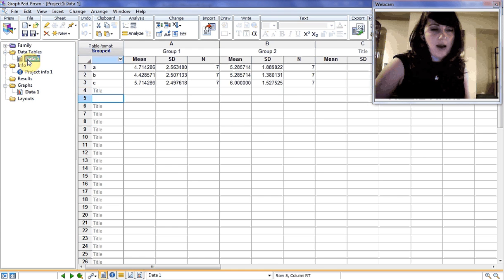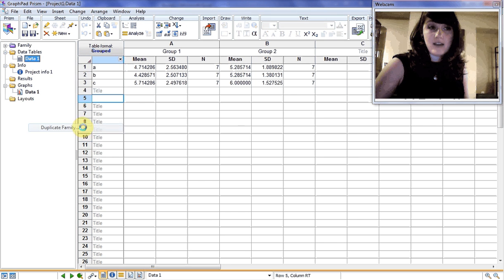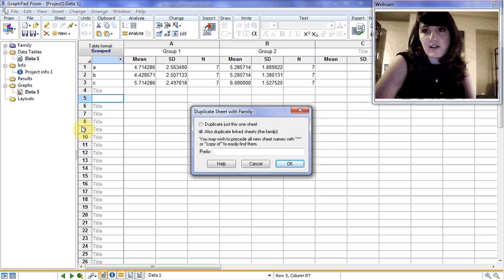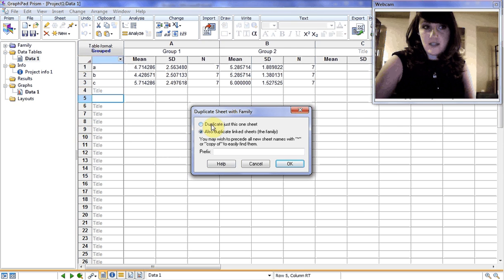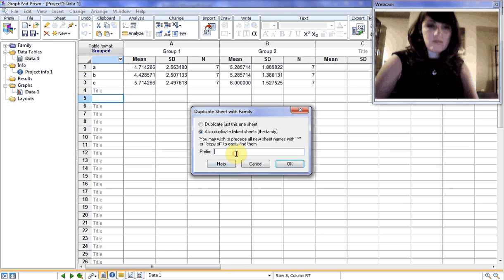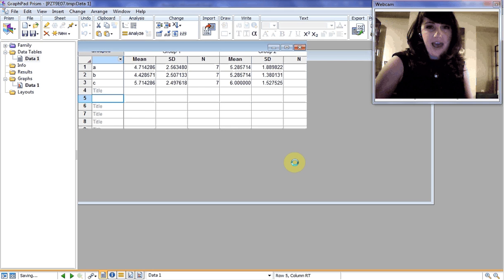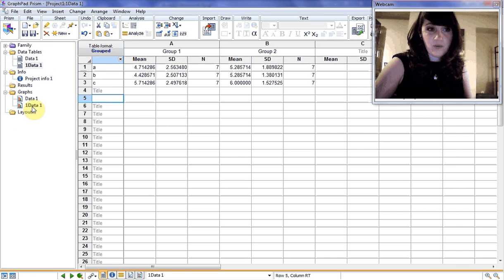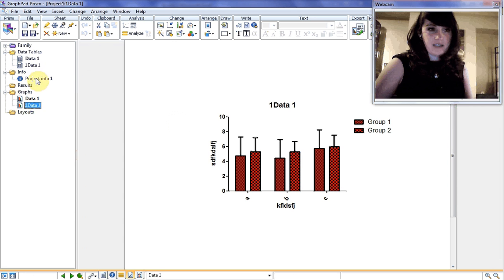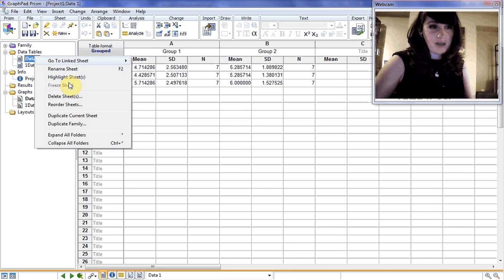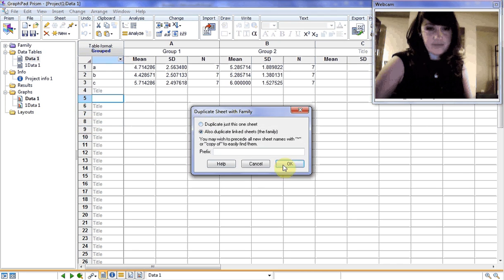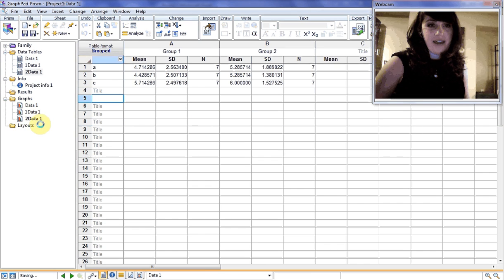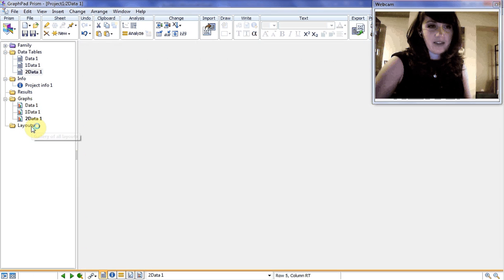What we're going to do is we're going to clone our data set first. So I'm going to right-click on data 1, duplicate family. This is really easy, particularly if you have to have seven graphs that are the same with just different data. I'm going to do the family prefix 1. GraphPad will just create another one, data 1, exactly the same thing. All of your settings are preserved. We'll make another copy, duplicate family, prefix 2.